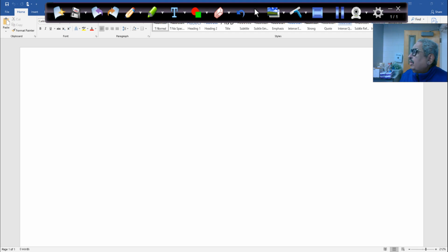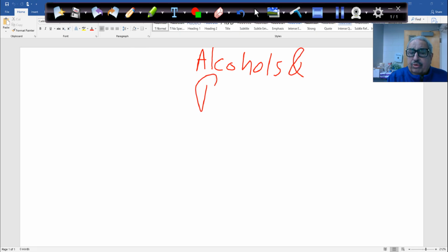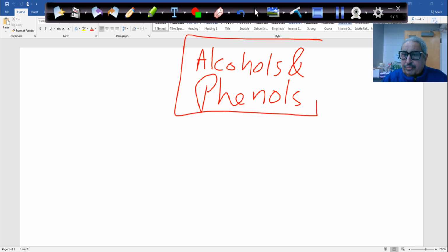Okay, guys. The experiment today is about alcohols and phenols. We'll have 4 alcohols, 1 phenol, and 1 unknown.